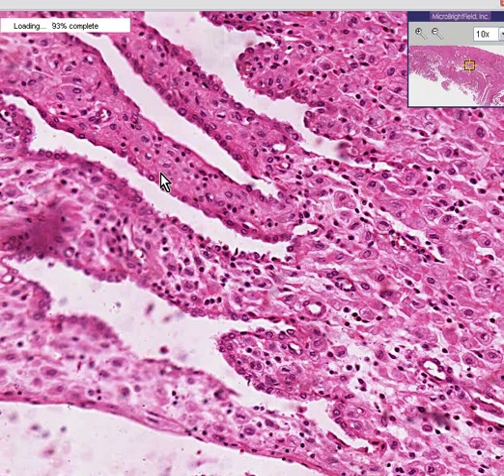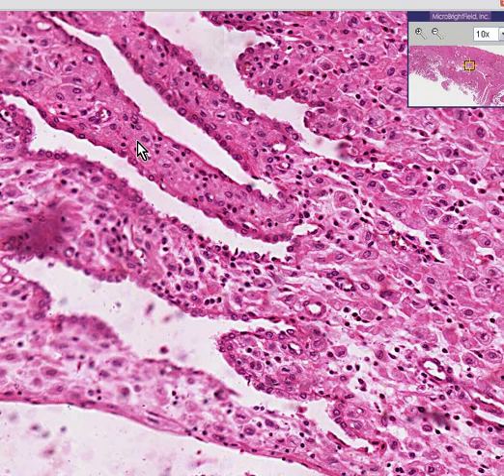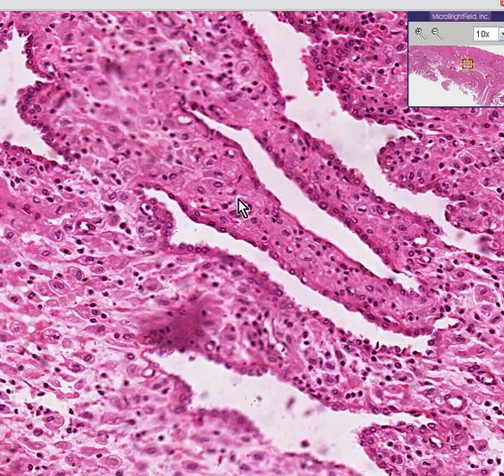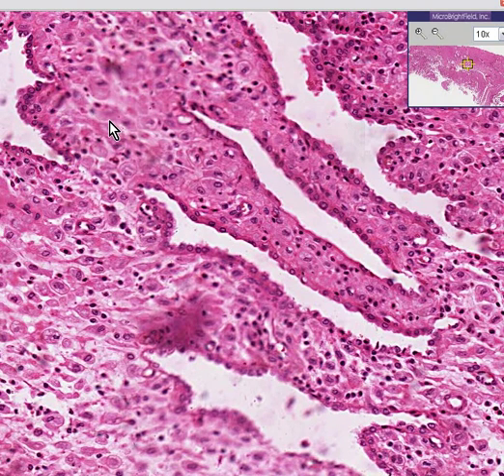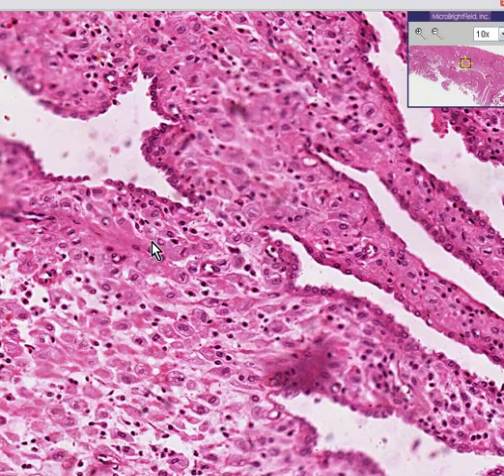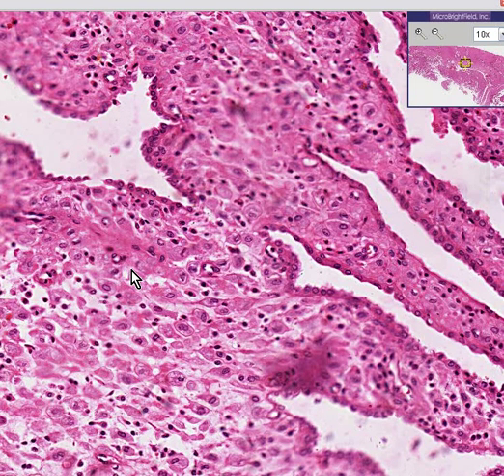This could be pregnancy, this could be external progesterone administration, or this could possibly even be the very end of the secretory phase of the menstrual cycle, in which the progesterone levels are the highest.